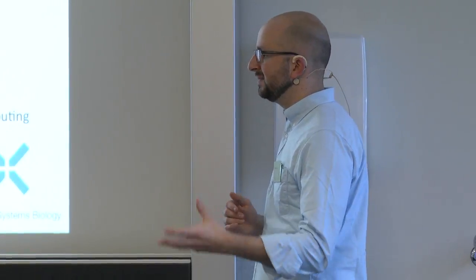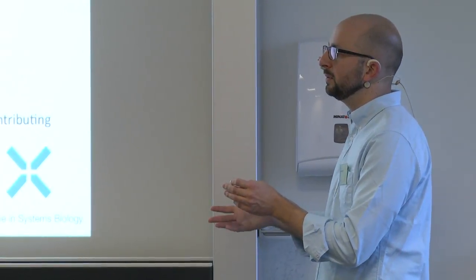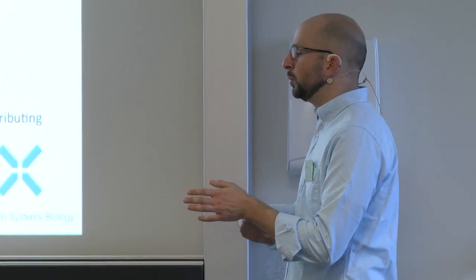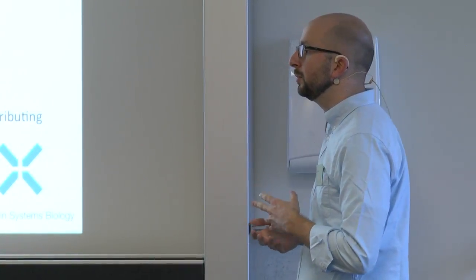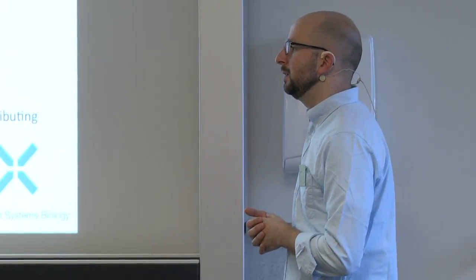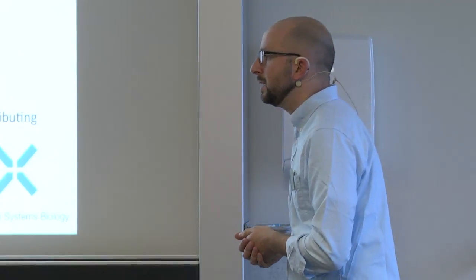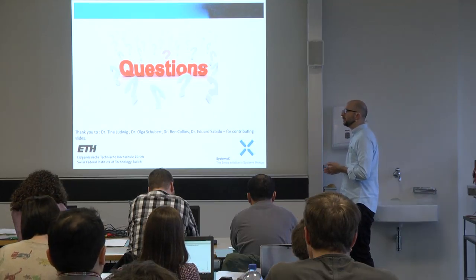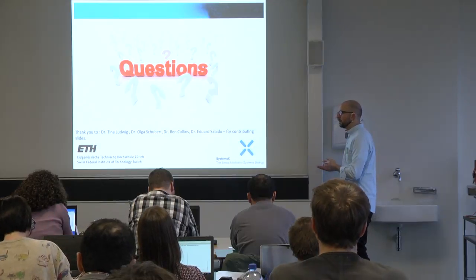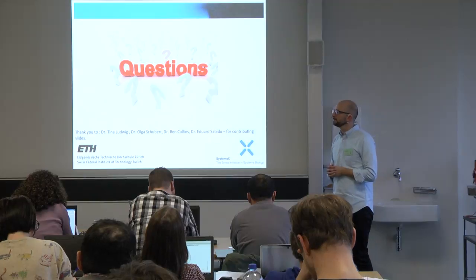So we can have an ion that is not very specific, but in this retention time it has no interference, and then it would be a very abundant ion. And I think in certain machines you would see this, for example, for the lower B ions, you would get very high peaks, but then they could be interfered, and they could also not be interfered. So the decision on when to use it or not is with respect to data, not just by guessing.